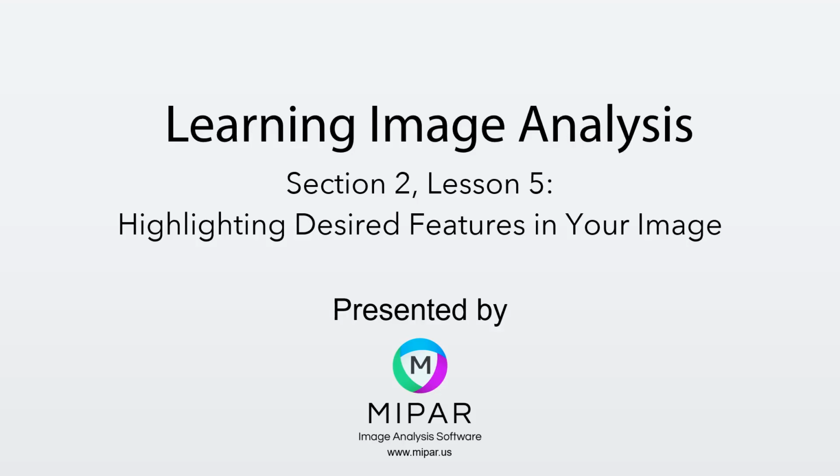Welcome back to Learning Image Analysis. Our topic today is highlighting desired features in your image.